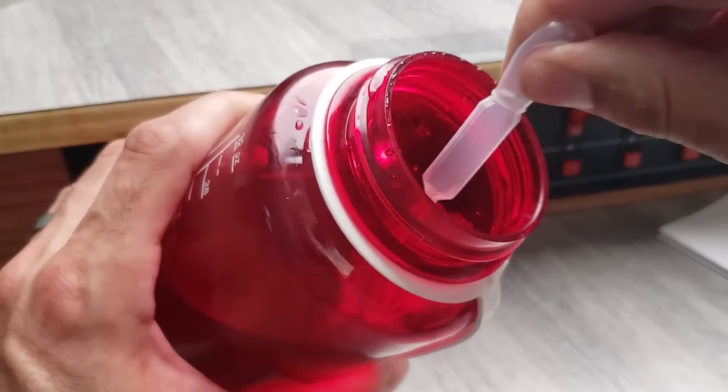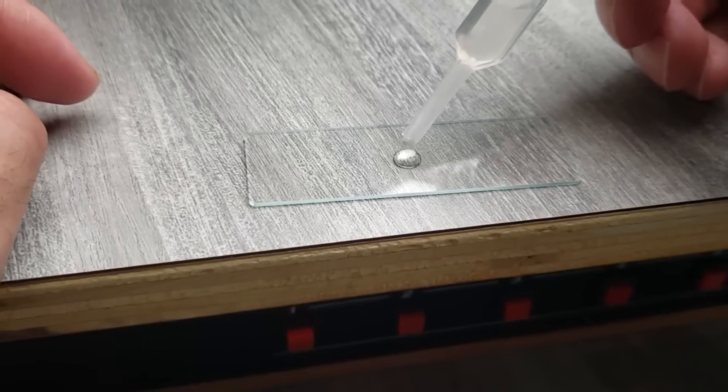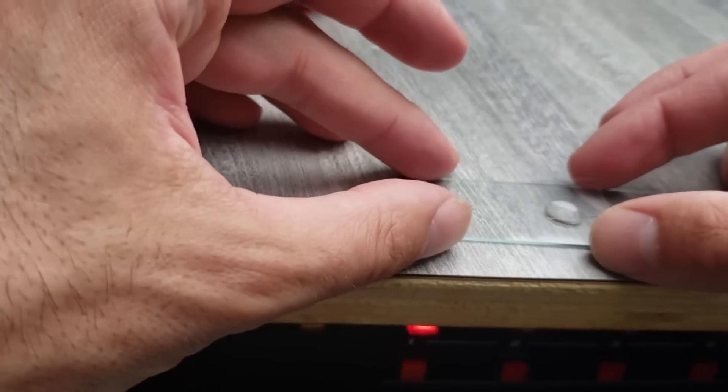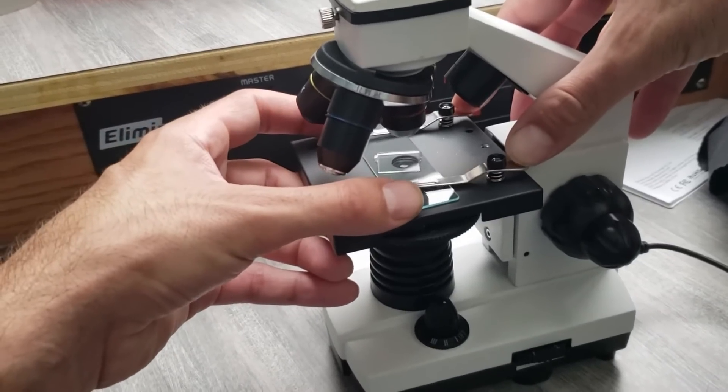All right, I'm going to take my eyedropper, pull up some of this water, and we'll place a sample right on our glass slide and place a glass cover on top. All right, let's take a look at our sample.